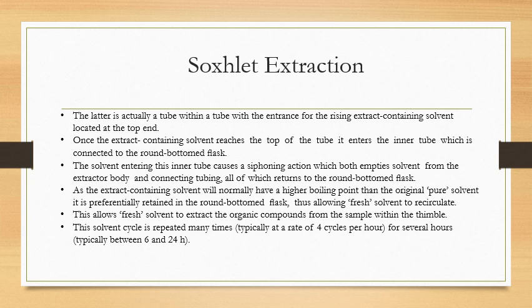The solvent entering this inner tube causes a siphoning action, which empties solvent from the extractor body and connecting tubing, all of which returns to the round bottom flask.